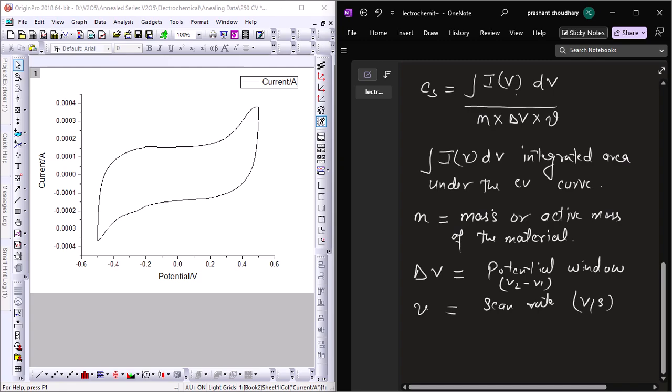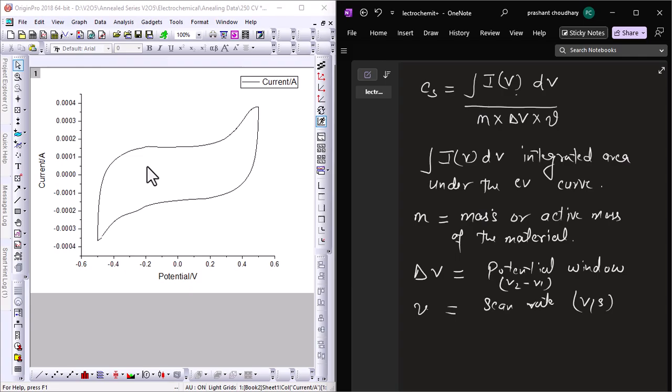Let's put the formula into action with a real example. I have a CV curve and I'm going to find out its integrated area.